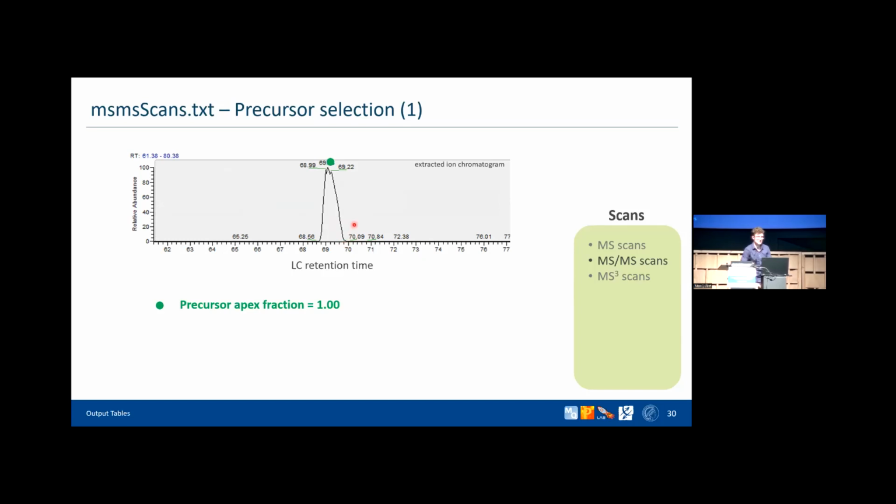So you can do this relative fraction. You take the peak, or basically the apex of that peak, and set this to 1. Then you look down and say, okay, at which ratio relative to this peak, if I did second MS over your retention time, did it still lead to identification?